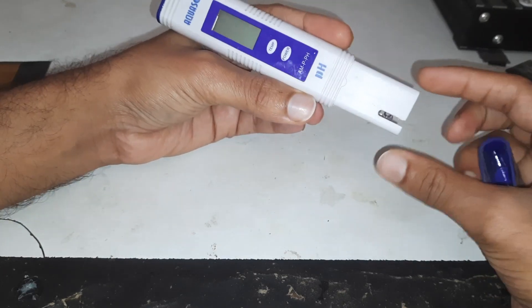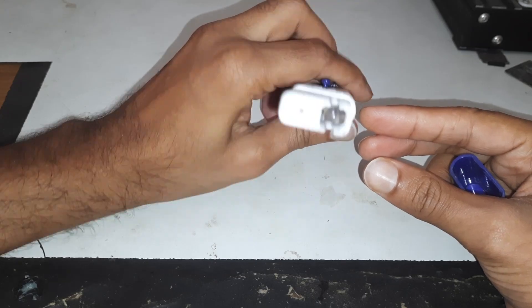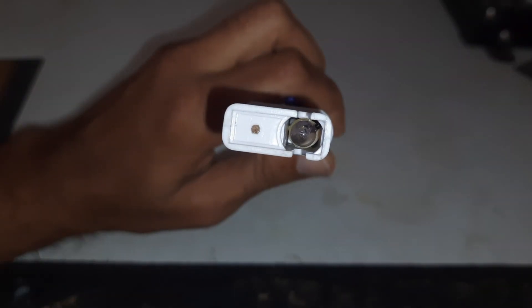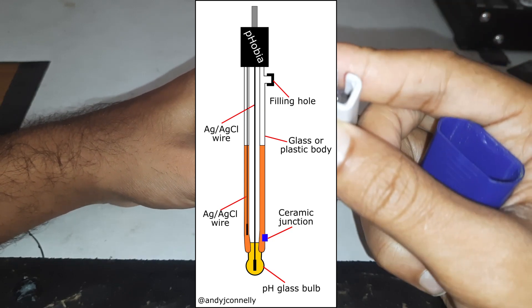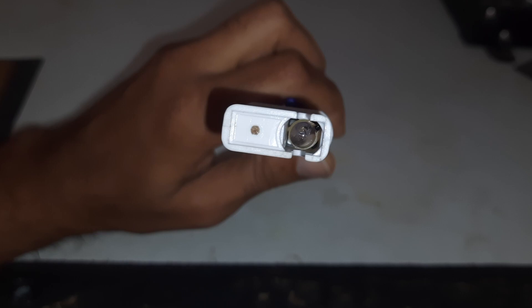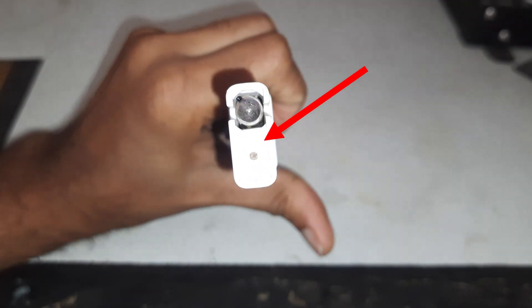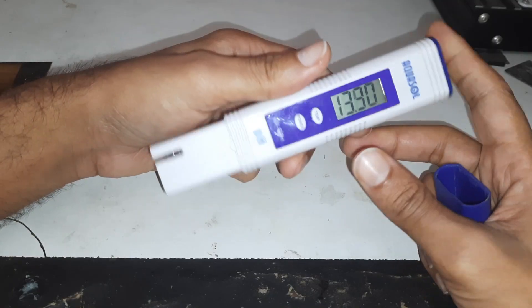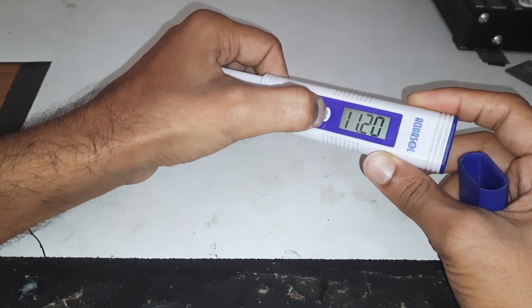In this video we are going to see the mechanism of a pH meter. This bulb-like thing is a sensor having liquid inside it. It has in fact two probes — one of them is thin and black. There is also one more probe for the thermometer, so it reads both the temperature and the pH of the substance.